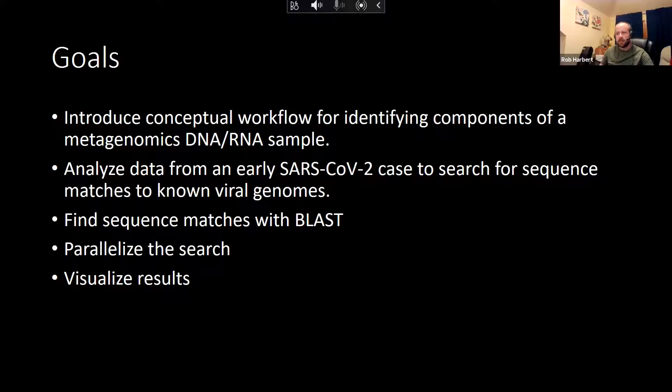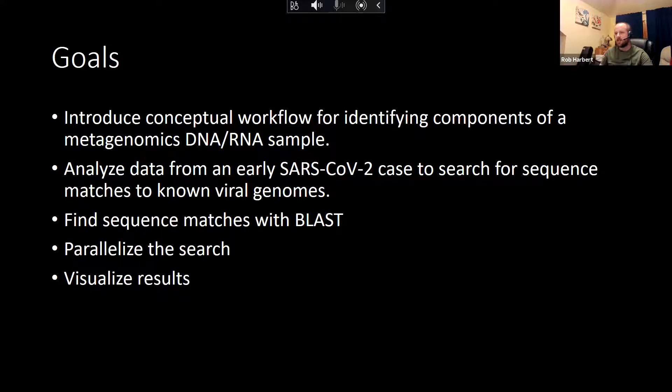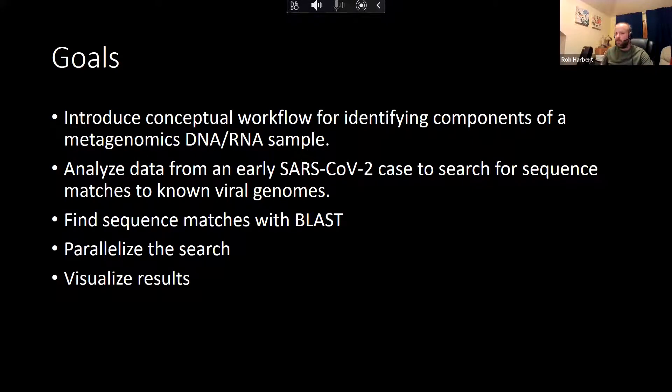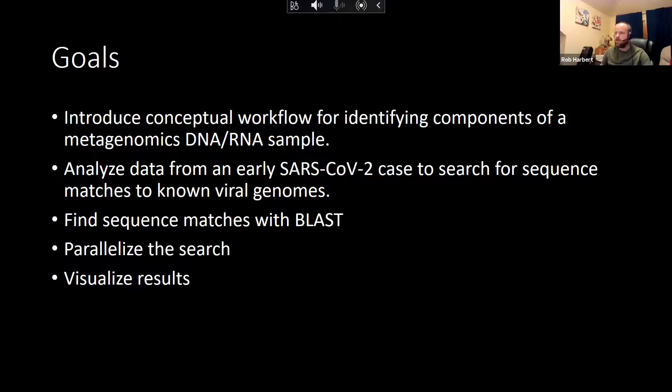A couple of things along the way for bioinformatics: we're going to parallelize this search. We can break up the BLAST search into chunks and speed up our search that way because we have access to a little bit more compute power. And then we will work on visualizing our results so you can see for yourselves where most of our viral sequence matches are.